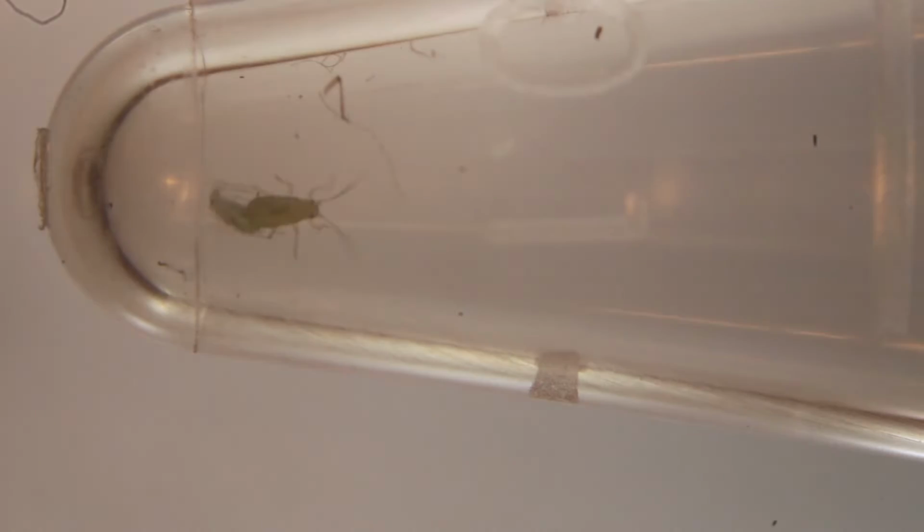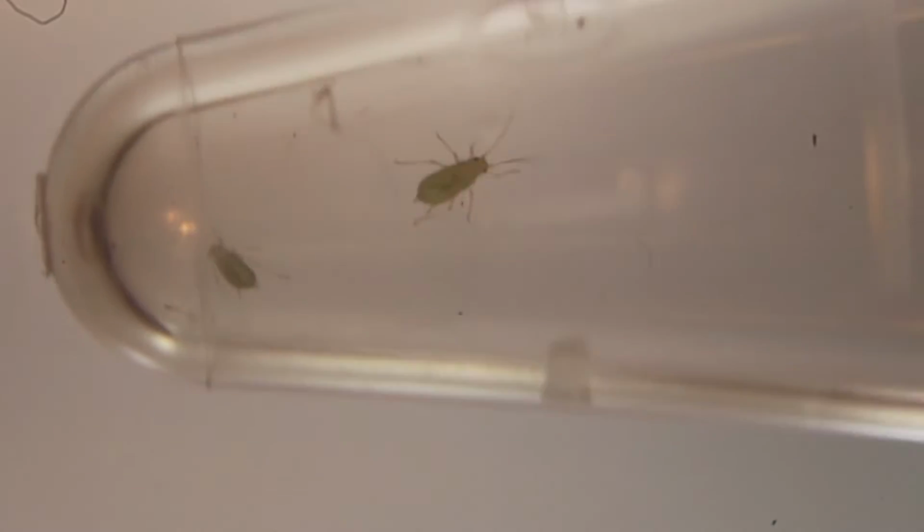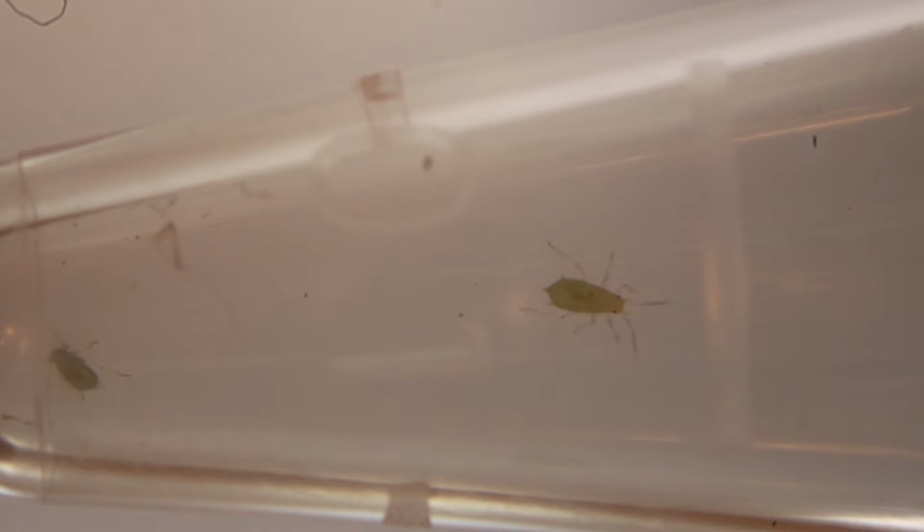So this first parasitoid wasp does not parasitize the aphid, so I put her in this amber colored tube to indicate that I've already used her. And now the larger aphid is the exposed aphid, and the smaller aphid is the clean aphid. And let's see if this new female Lysiphlebus will parasitize either of them.